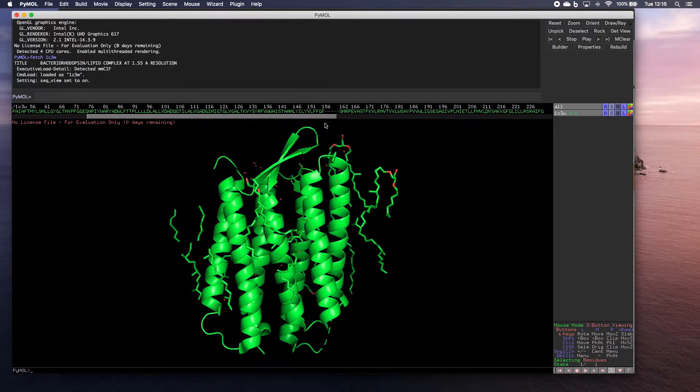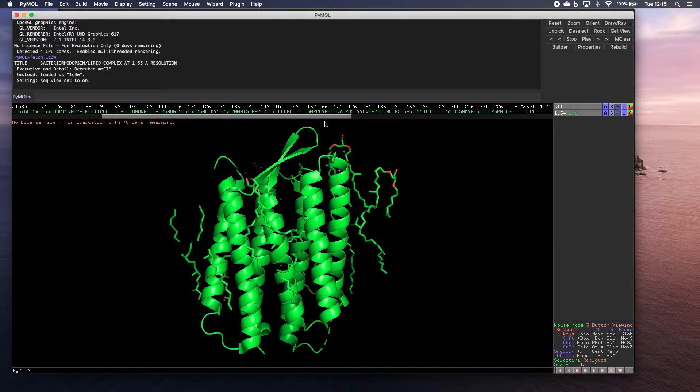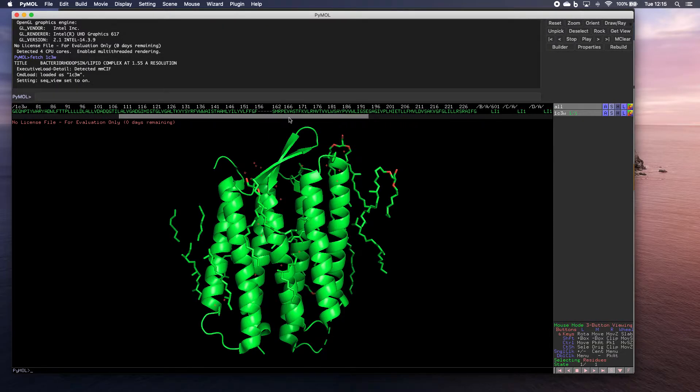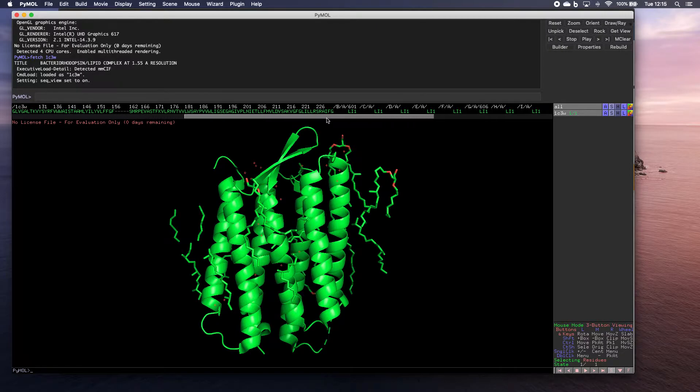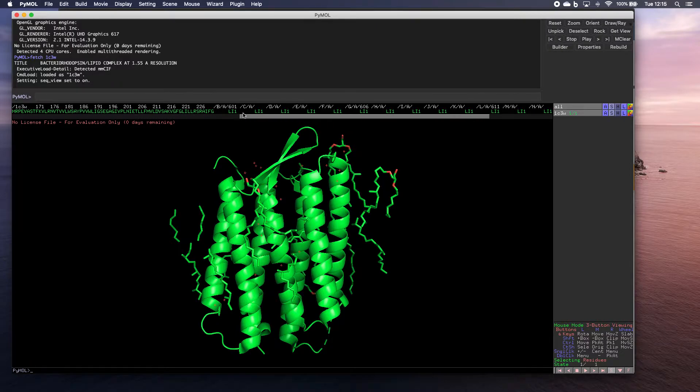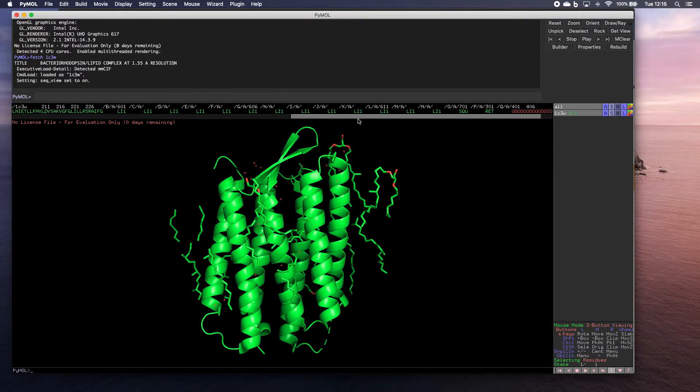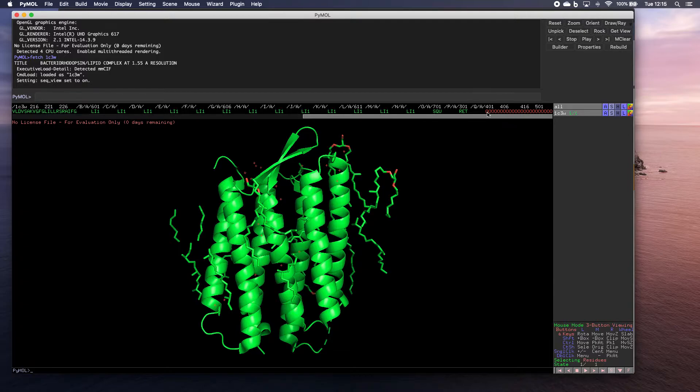And this shows you the amino acid sequence of the protein. So you can scroll through there. And then we've also got all of these, which are the different ligands and the different other molecules associated with them. And then these red ones down here, all the water molecules.